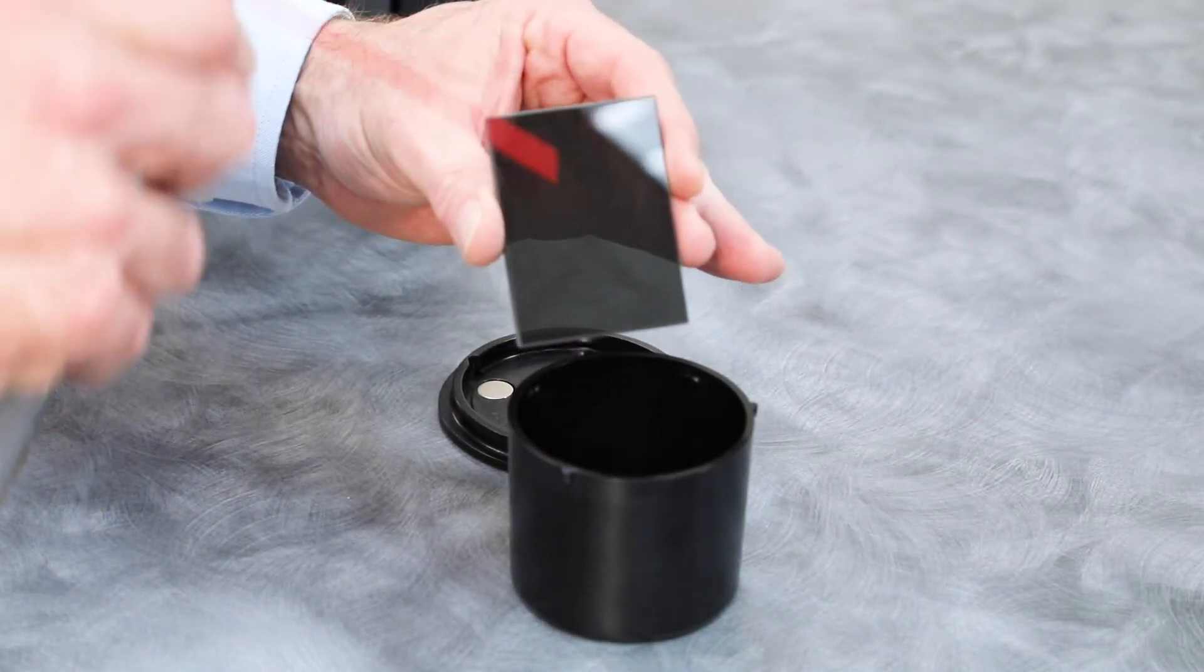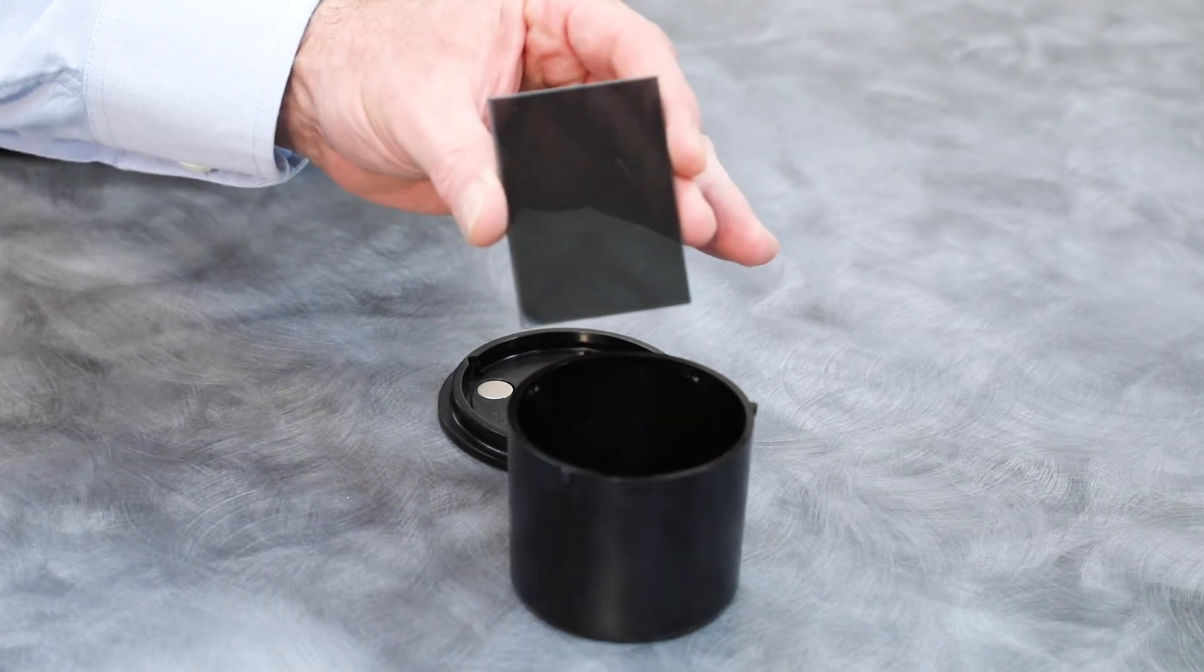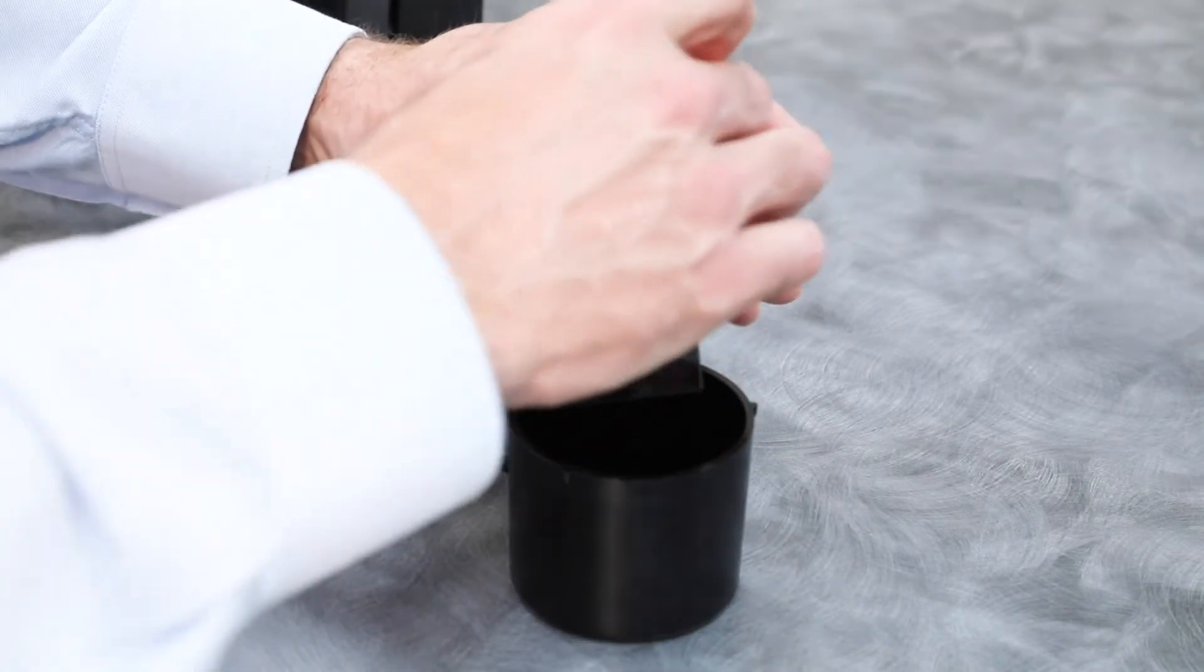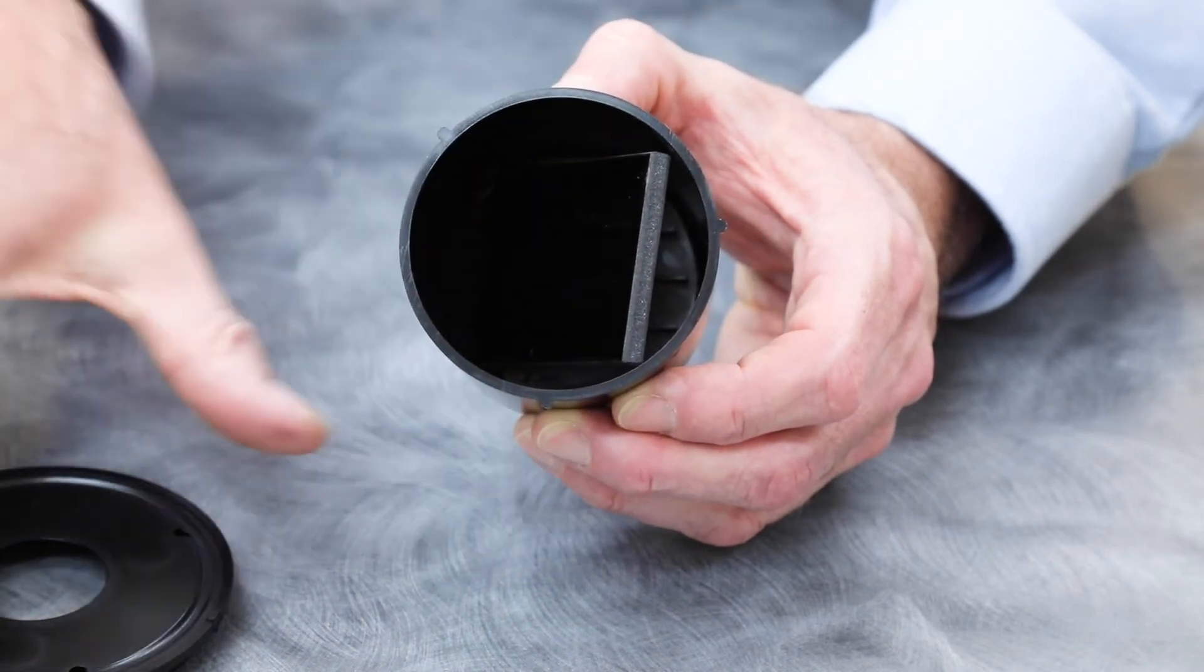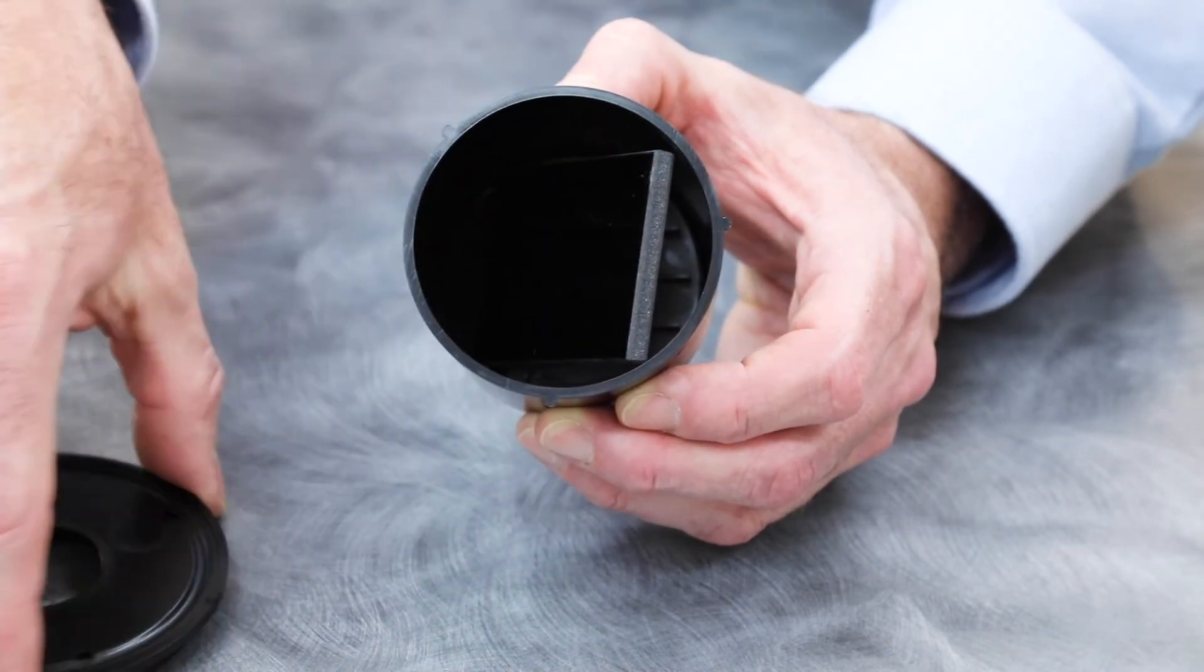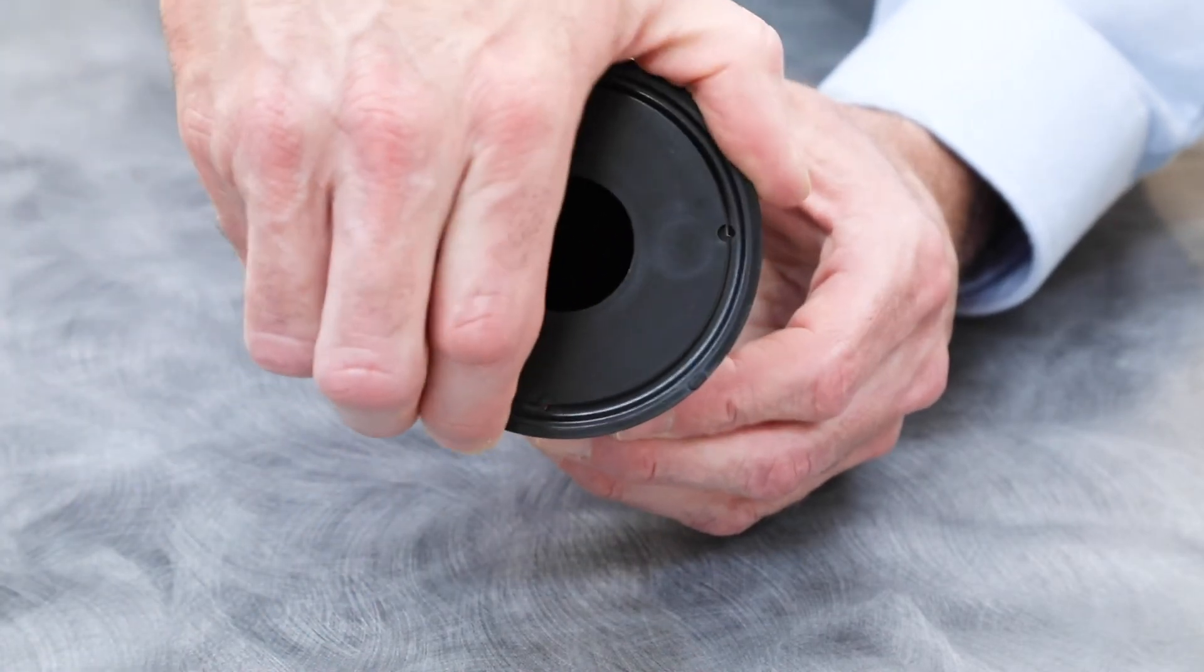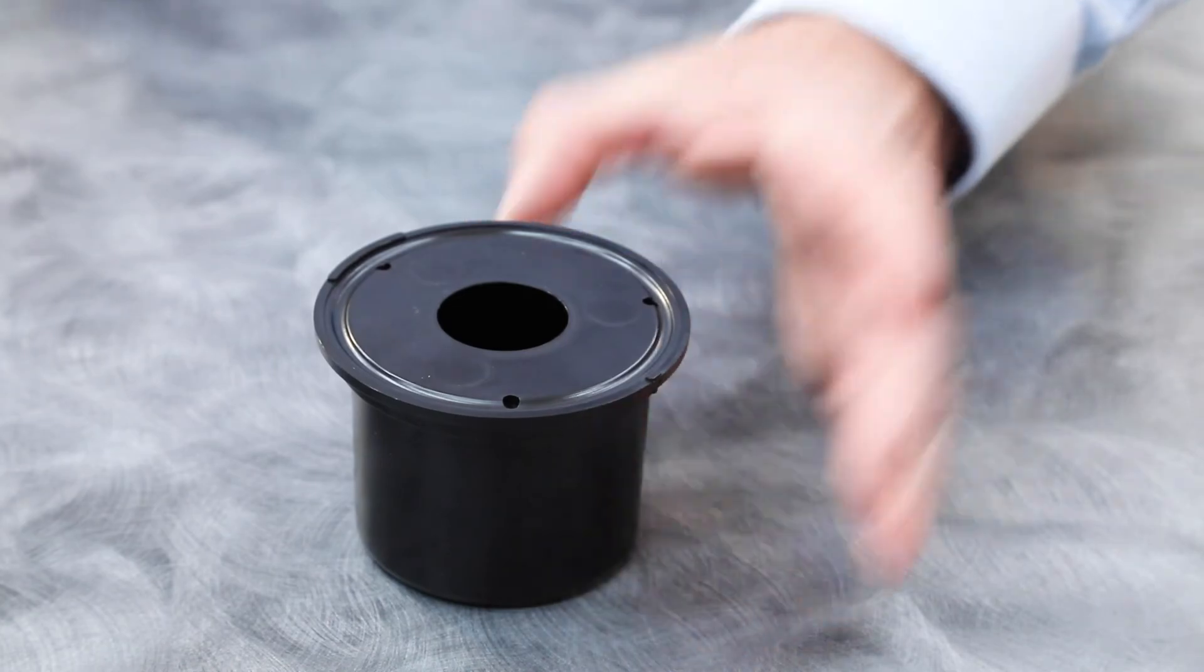Blow short bursts of clean, dry air across the trap glass and inside the trap. Then reinstall the black glass into the trap. The bottom edge should be resting against the felt pad at the bottom. Use the base tabs to position the trap back onto the base.